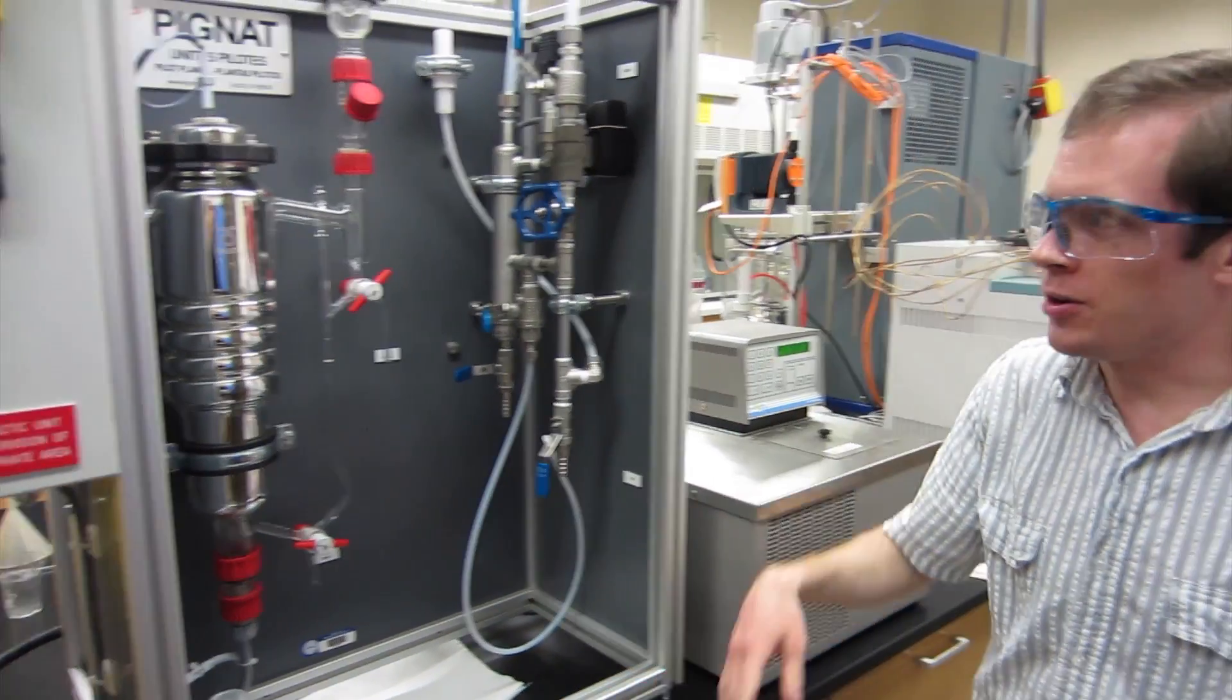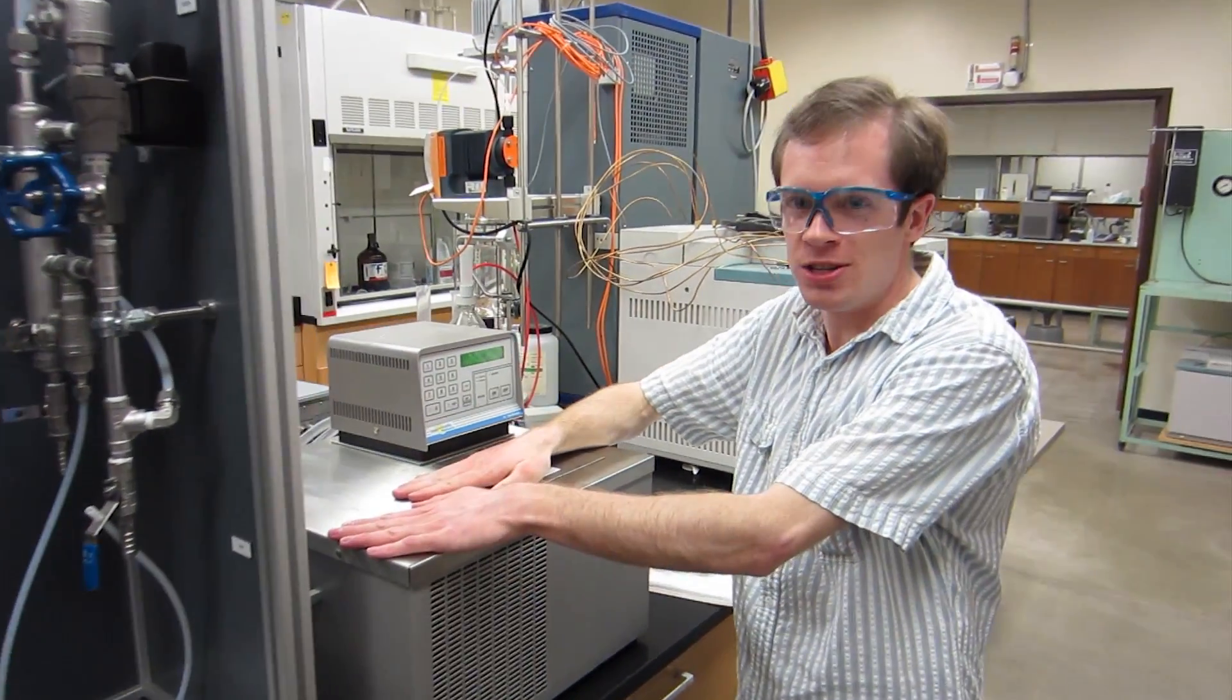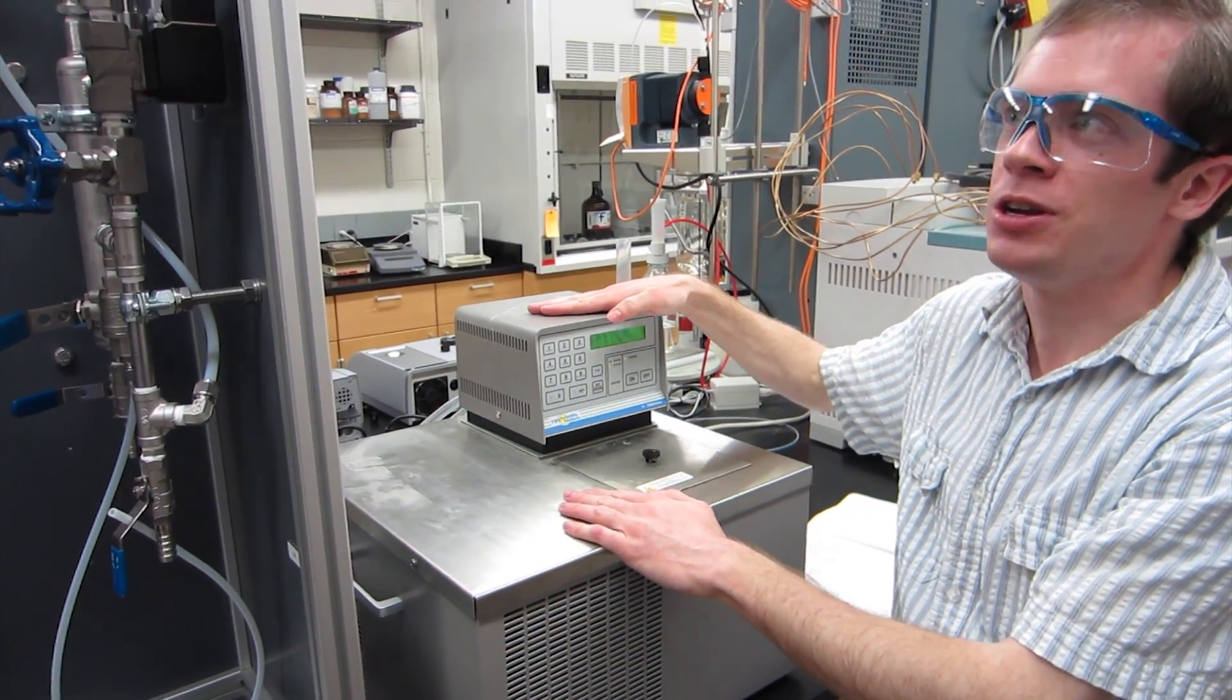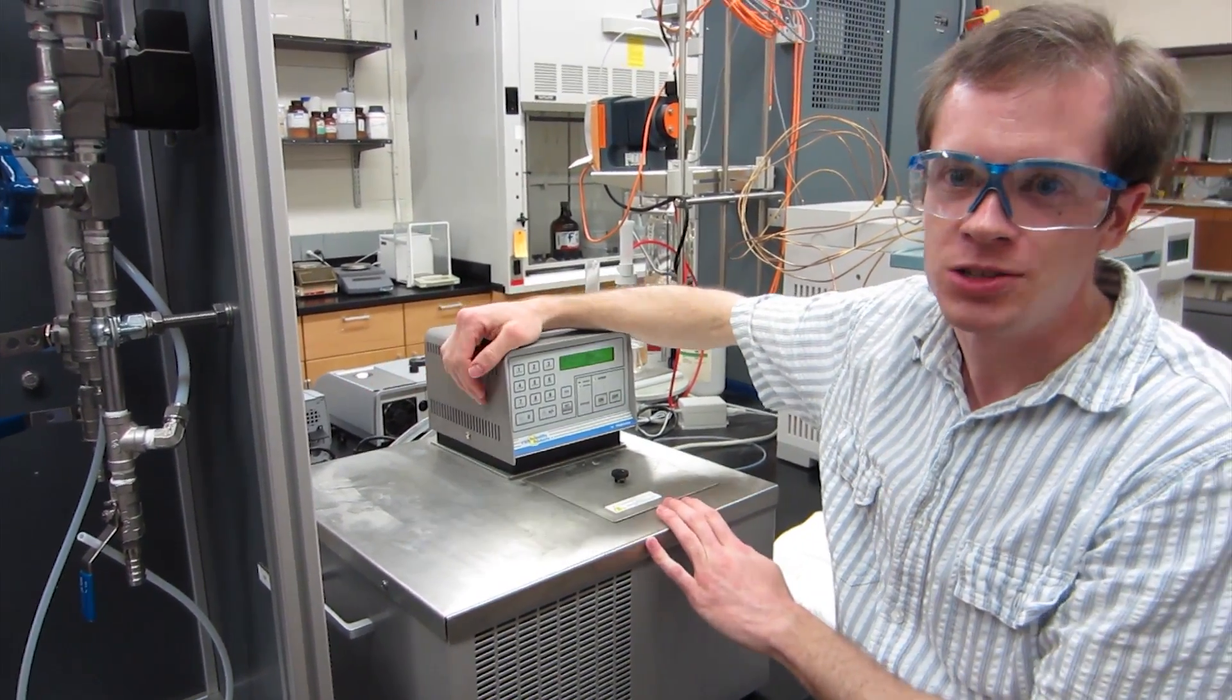Now to get this thing started, first we need to turn on the cooling unit which is this bad boy right here. We just turn it on and it's already set to 10 degrees which is where we need our condenser to be operating.